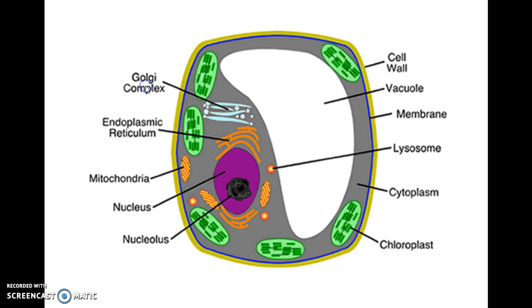If we contrast those to the plant cell, it has really square, boxy shapes, and we've talked about this many times before. Differences between plant and animal cells: the plant cell has the large water vacuole in the center over here. It has a cell wall on the outside. It has chloroplasts that are where photosynthesis happens and contain chlorophyll. So some of the slides today involve animal cells, and some involve plant cells as well.